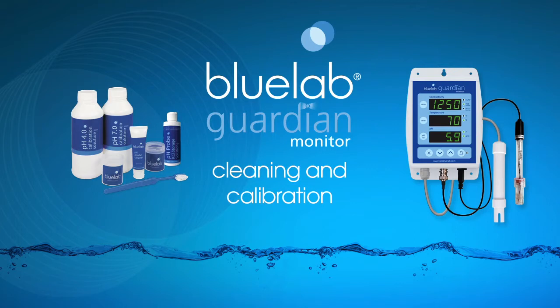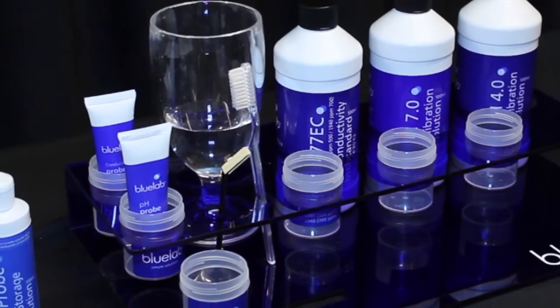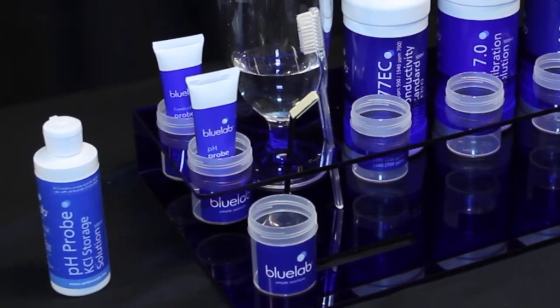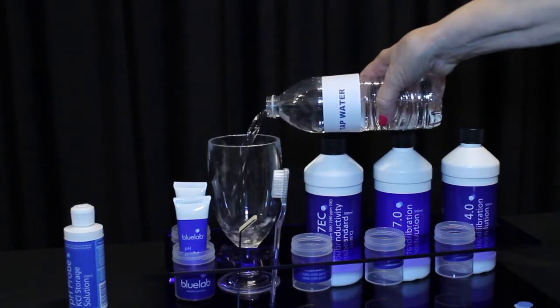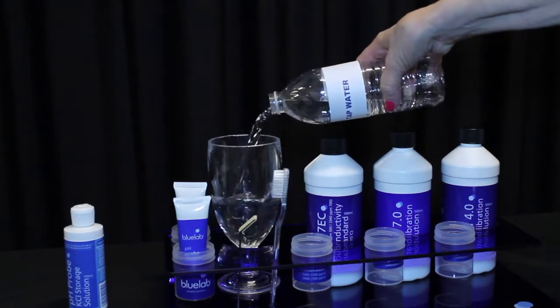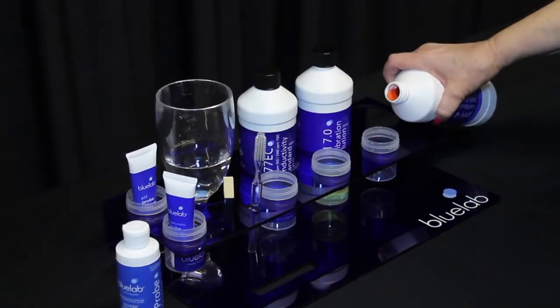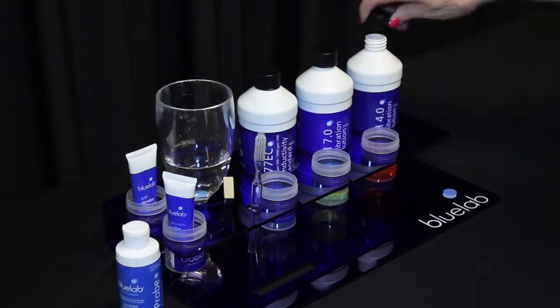Hello and welcome to Bluelab's official video on how to clean and calibrate the Bluelab Guardian monitor. To ensure accurate readings, the probes need to be cleaned and calibrated each month. You will need fresh tap water, probe cleaning instruments, plastic cups, calibration and standard solutions, plus KCL storage solution. Bluelab probe care kits contain the items you will need for cleaning and calibrating your probes.